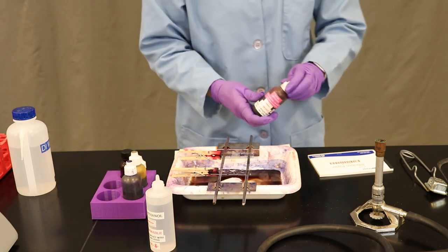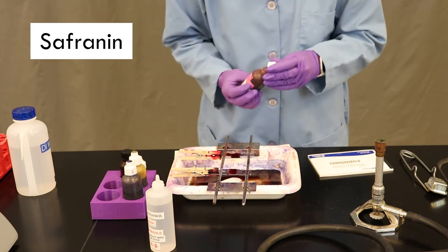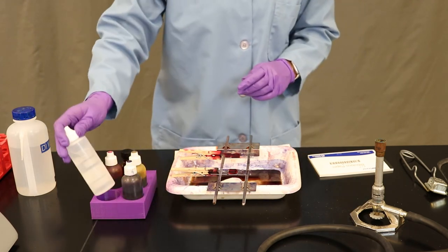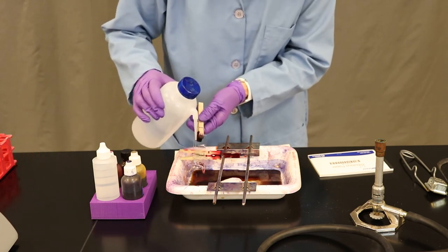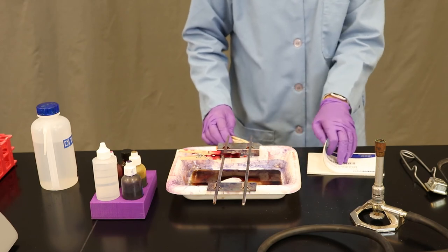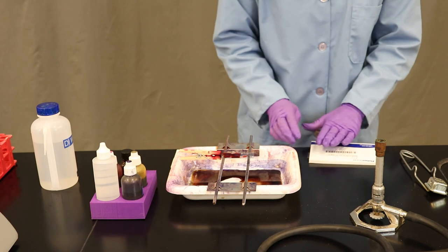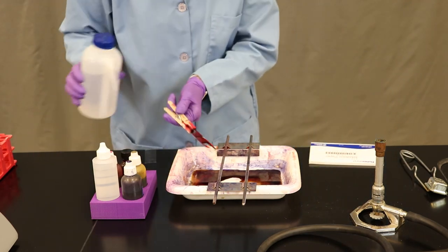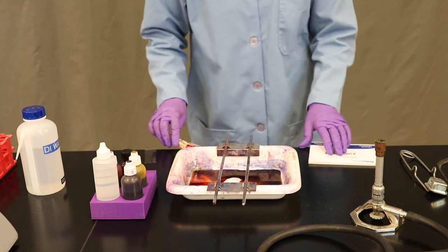Last but not least is the counter stain called safranin. Again, flood the boundary where your bacterial cells are located. You're going to keep the solution in place for up to 60 seconds. Once your 60 seconds is up, once again angle the slide and rinse off the safranin until the droplets run clear. Dry the glass slide by placing it between two sheets of bibulous paper and gently blotting the glass slide. Be careful, it's super easy to break it at this stage. Rinse your second slide and again blot dry.